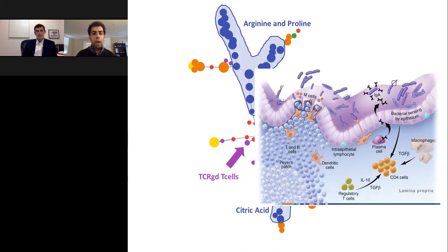We can also look at the correlation network. Like before, we can reduce the model to the number of measurements that are necessary, and then we can put them in a correlation network and annotate the parts that we understand the biology of. We won't go into the details of this network.